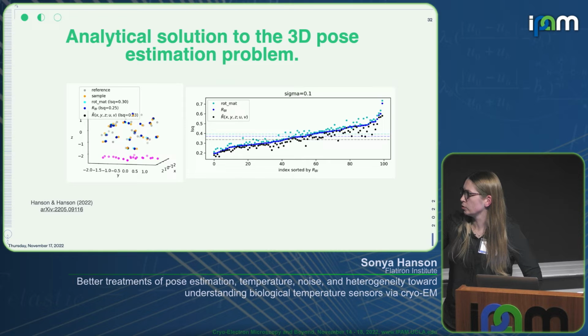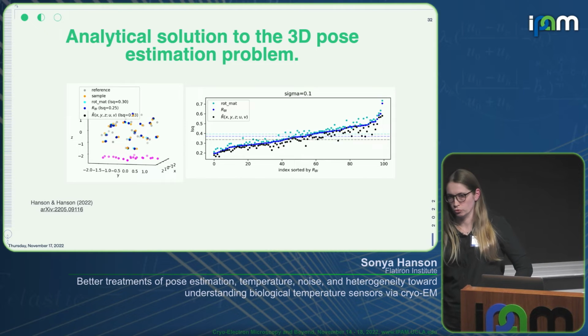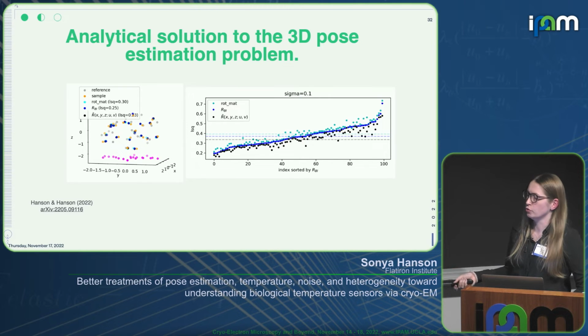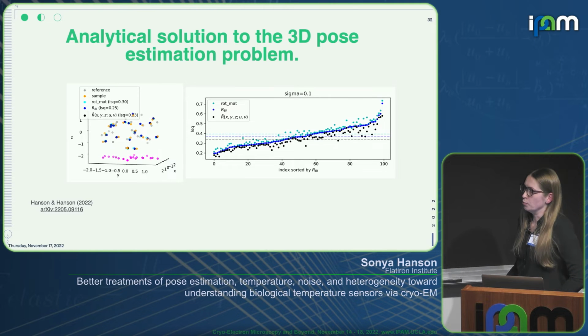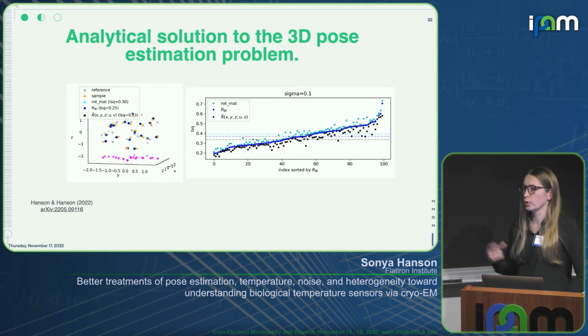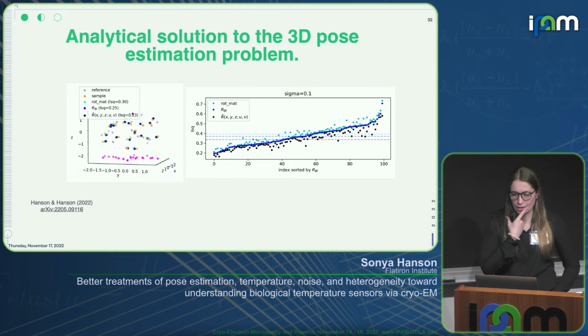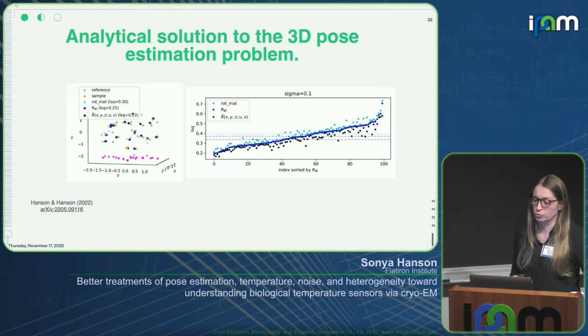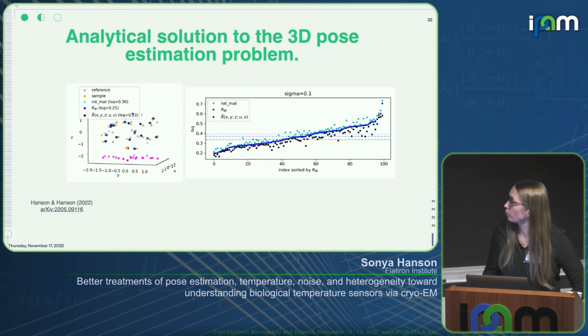But our RBI, which is the Bar-Itzhak corrected version, which is a true orthogonal rotation matrix, still performs better than the initial rotation matrix that we used to generate the rotated point cloud. And so here, this is a really compelling argument that we've truly minimized this rotation and are able to produce results that have not been seen before.